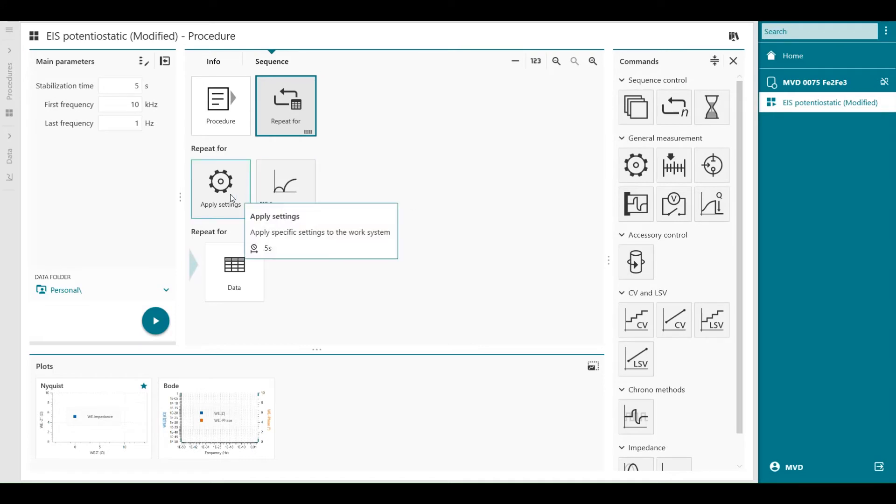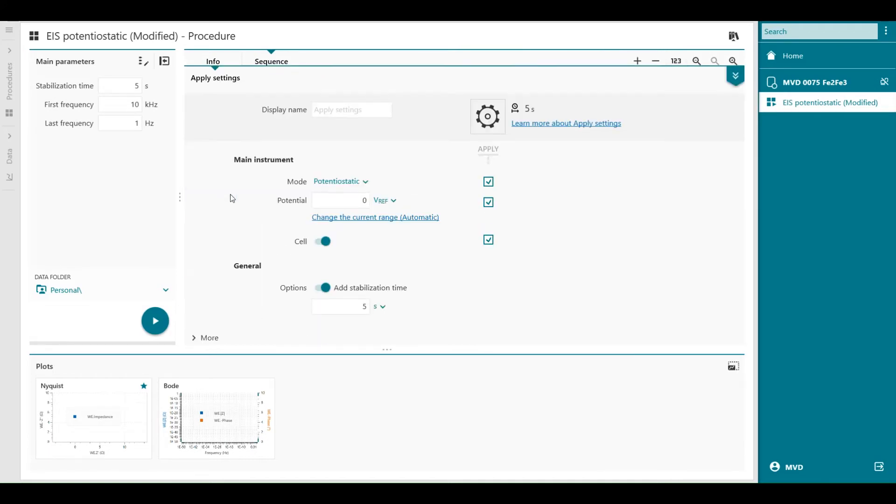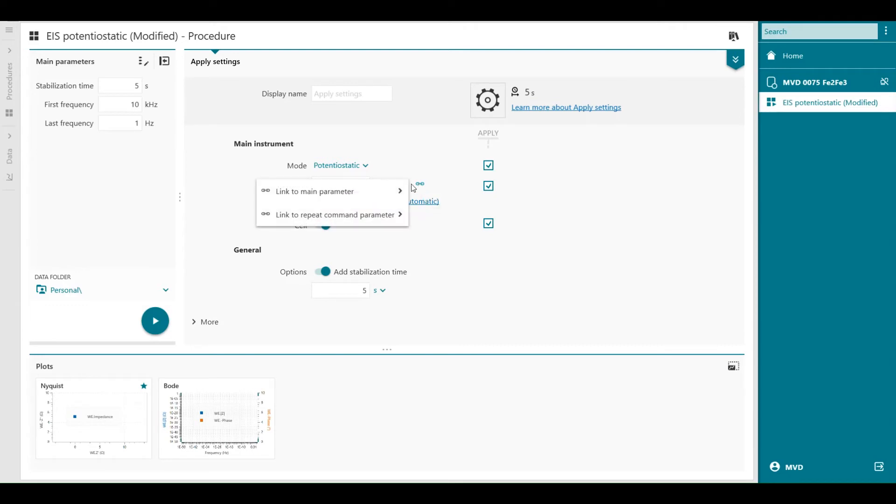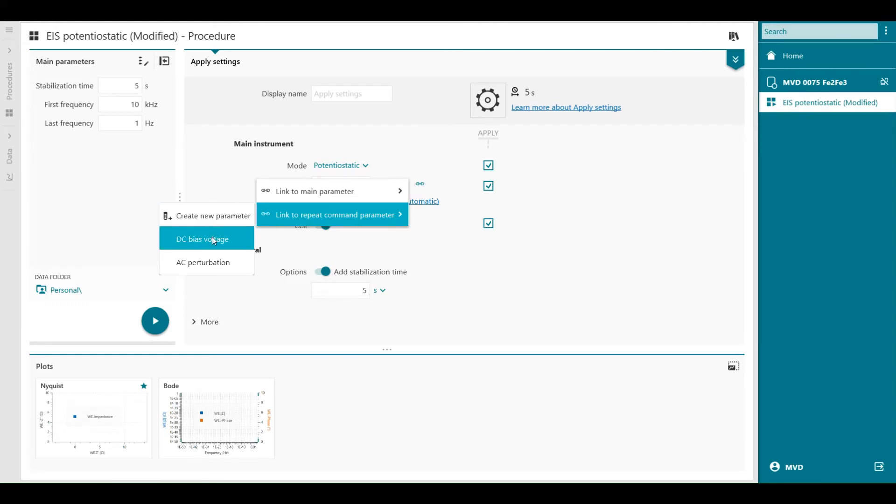Now I can go inside of the command and apply settings for example. And behind the potential which is the DC potential which you apply, I can link to the repeat loop. For example as a DC bias voltage. Now it's linked.